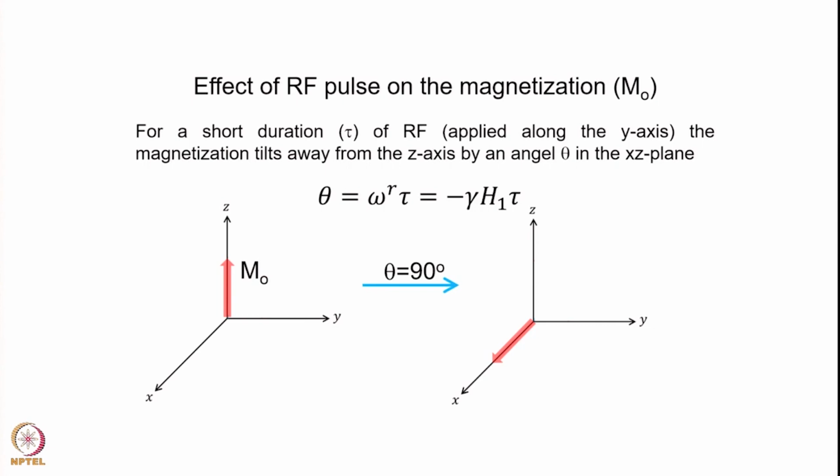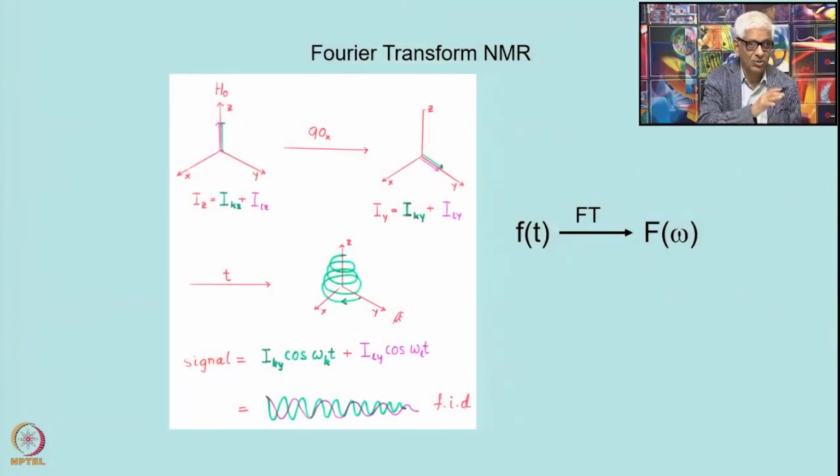So now the magnetization is in the transverse plane. In this case the pulse is applied along the y axis and therefore the magnetization is rotated along the x axis. Okay. So now what happens after this? Now the pulse is removed, so there is no more rotating frame, the magnetization will have to go back to the equilibrium, and this is what will happen. Sometimes I put the magnetization on the x and sometimes on the y, but it does not matter, they are all in the transverse plane. So in this case we applied a 90x pulse, the magnetization has come onto the y axis here. In the previous slide it was here, but it does not matter, if I apply a pulse along x it will come onto the y.